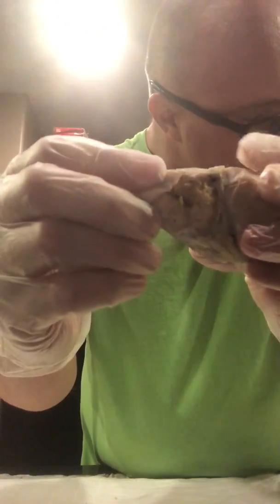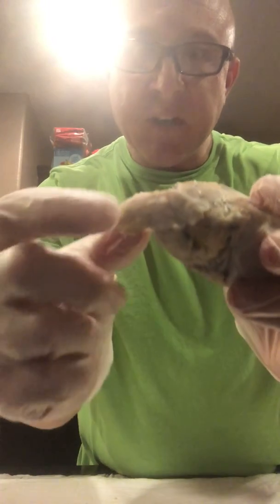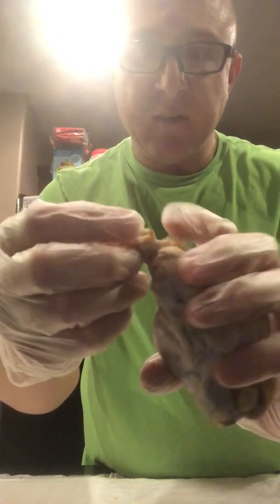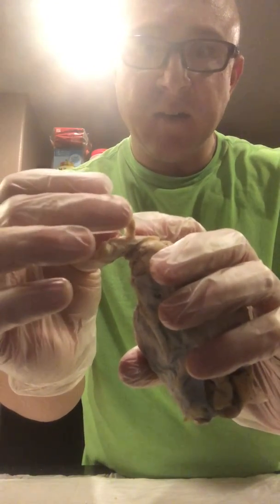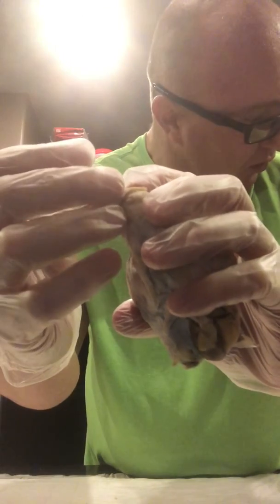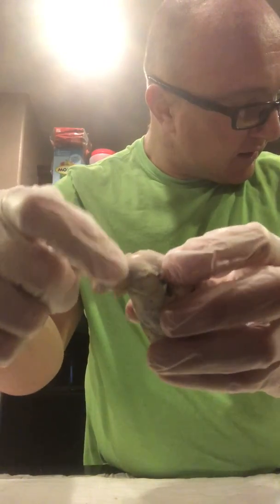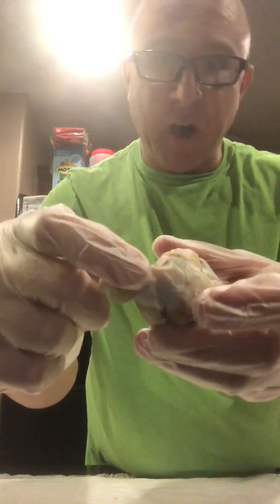For the spinal cord, the white matter is going to be the outermost layer. The gray matter is going to be internal. The dorsal root is going to be the outside here, and the ventral root will be where it connects itself to the spinal cord.